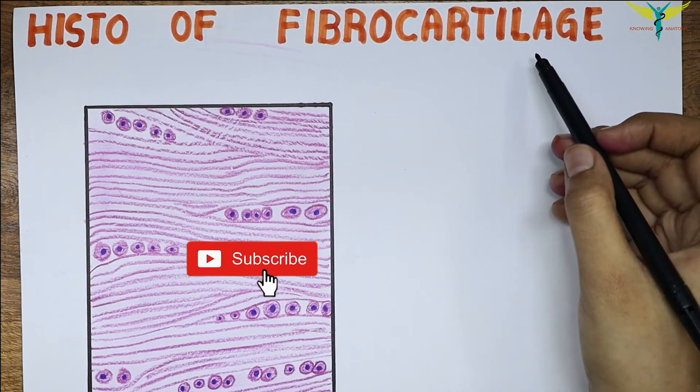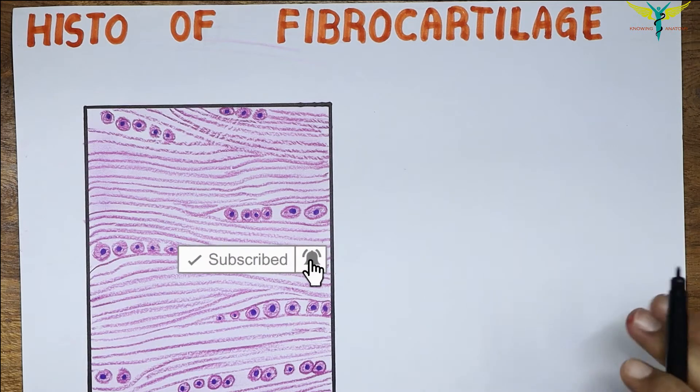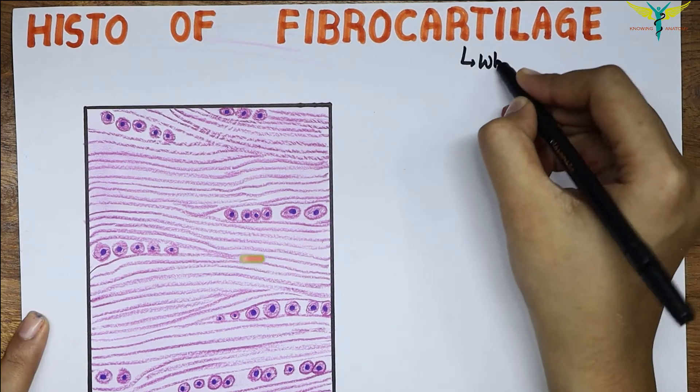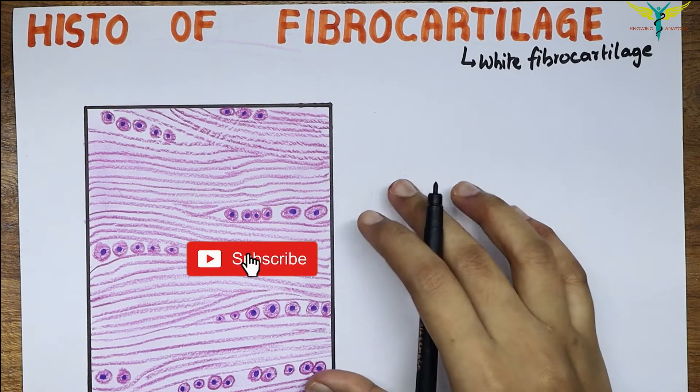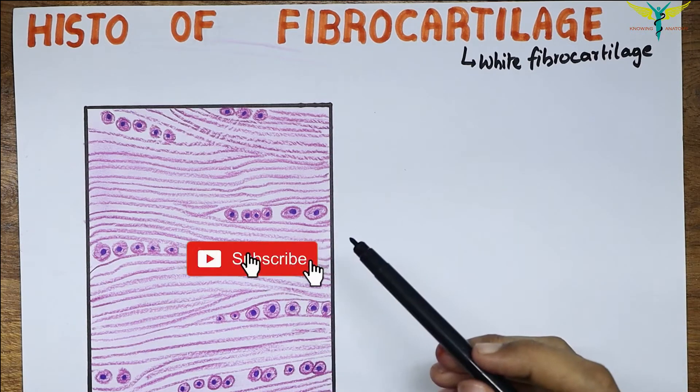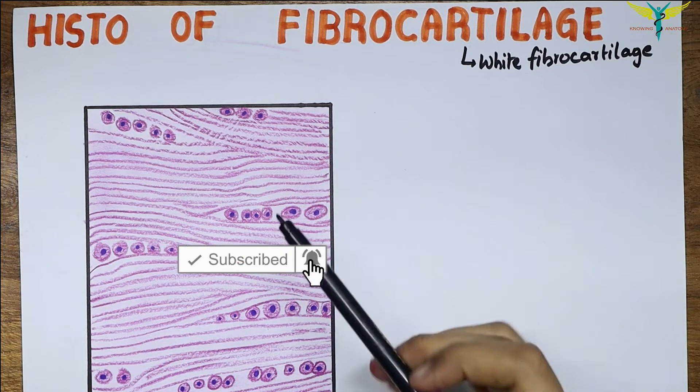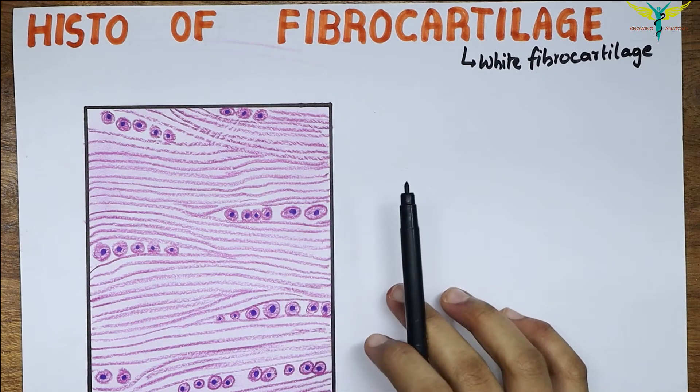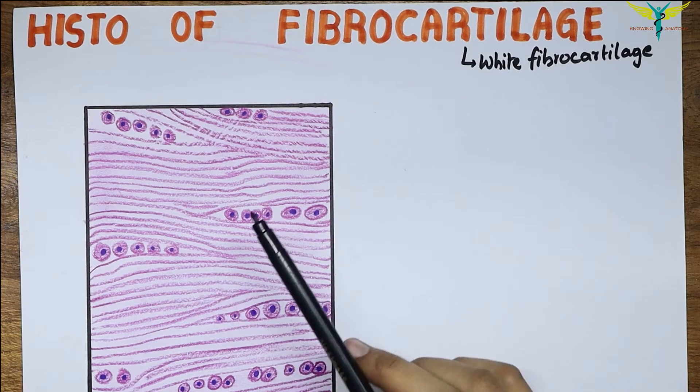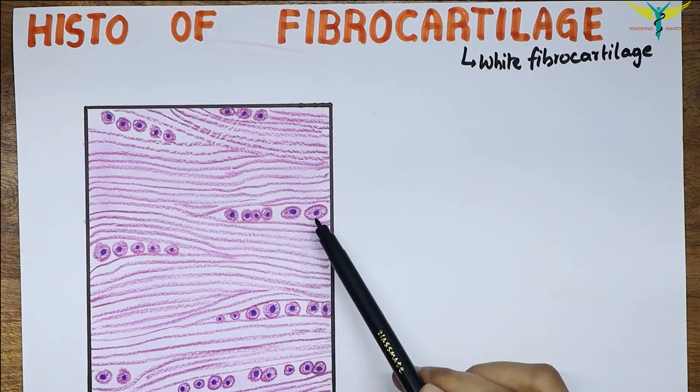Histology of fibrocartilage. This cartilage is also called white fibrocartilage. On superficial examination, this fibrocartilage looks very much like dense fibrous tissue.